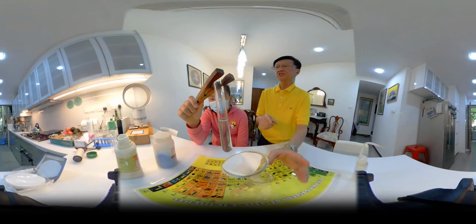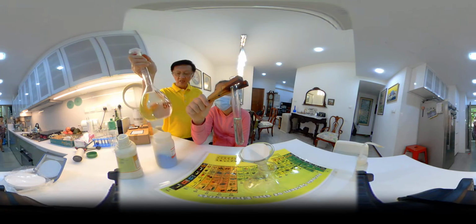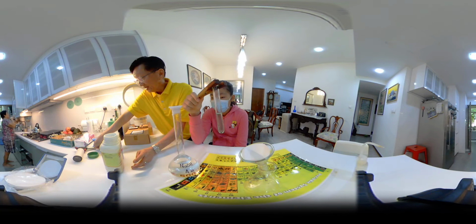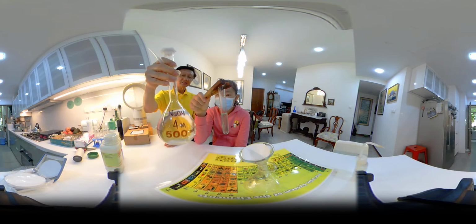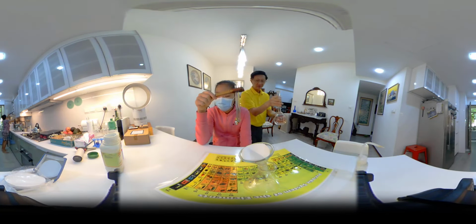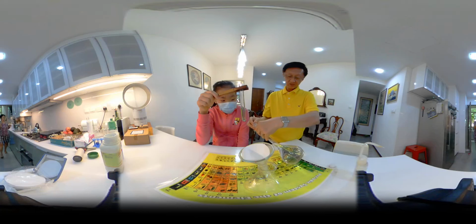Now we got to precipitate out the nickel by putting in sodium hydroxide, NaOH, and we are going to precipitate out the nickel by putting in sodium hydroxide.